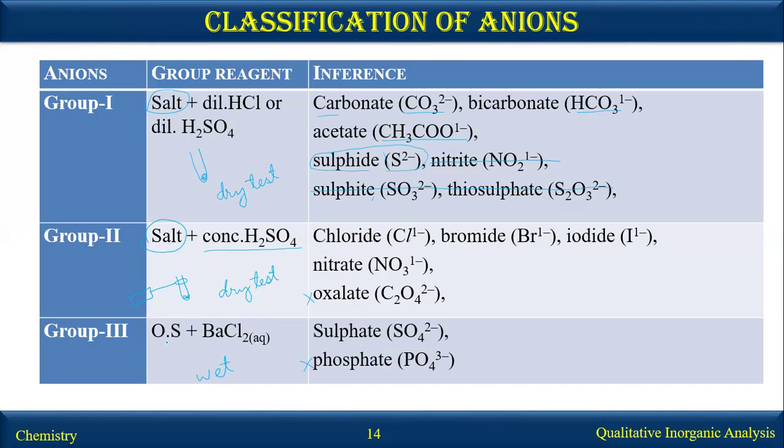But here in group 3, OS stands for original solution. We make the original solution, and usually the original solution at intermediate level is made in cold water.